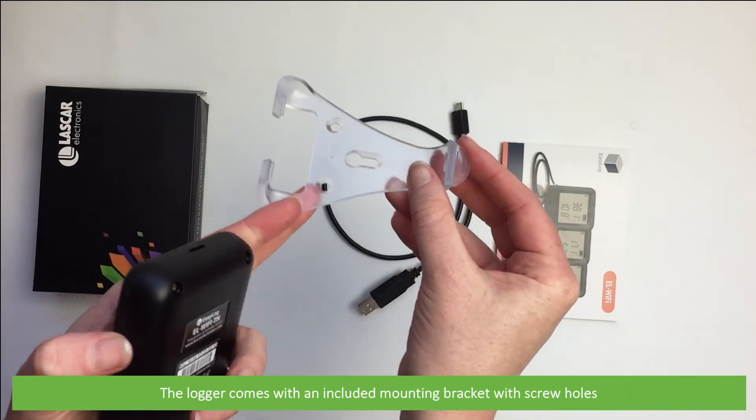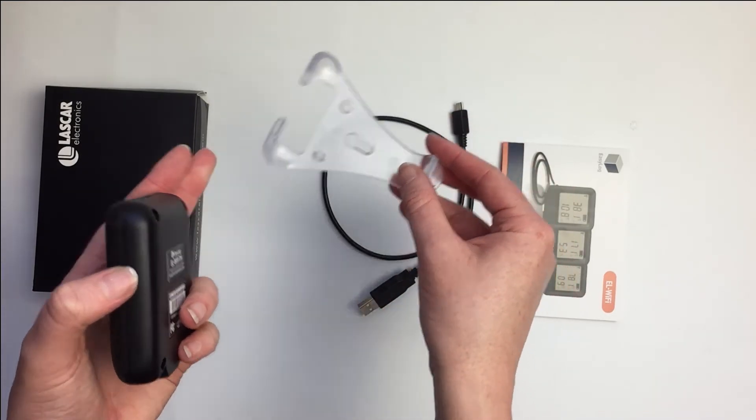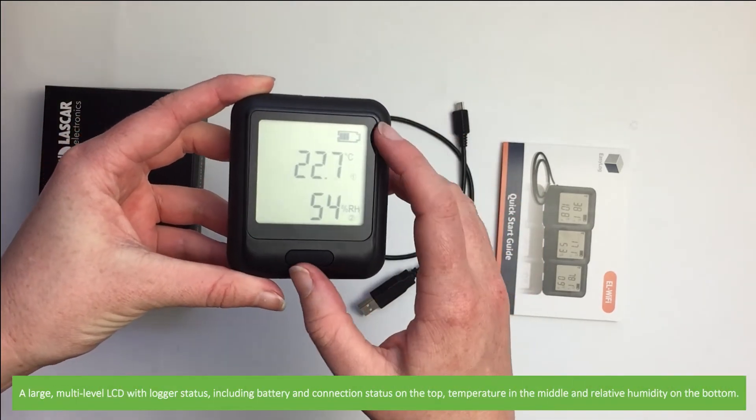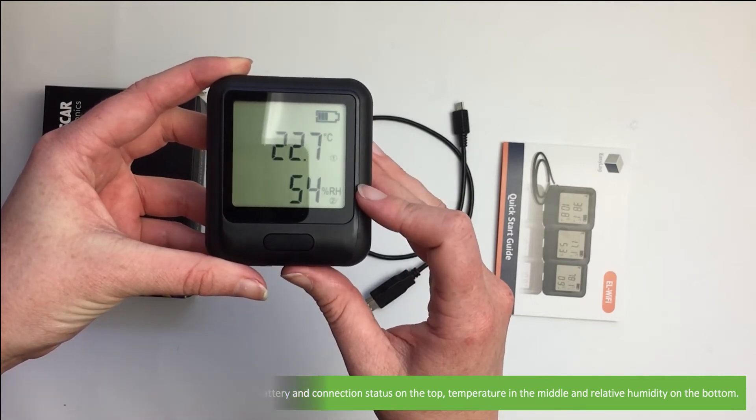The logger comes with an included mounting bracket with screw holes. There's a large multi-level LCD with logger status including battery and connection status on the top, temperature in the middle, and relative humidity on the bottom.